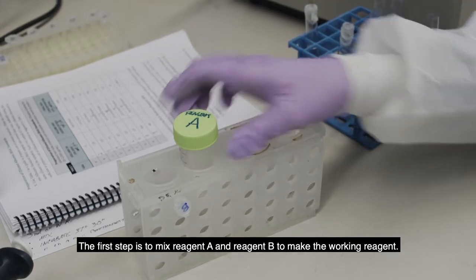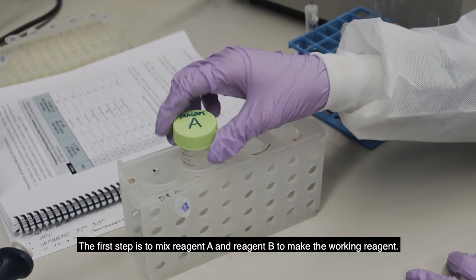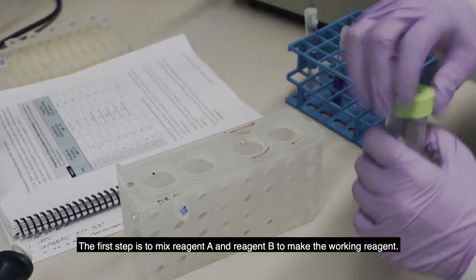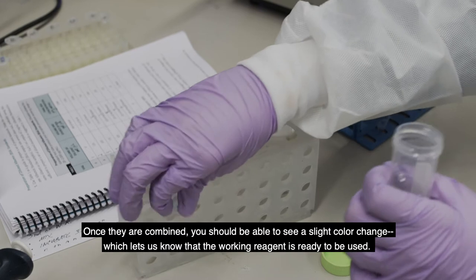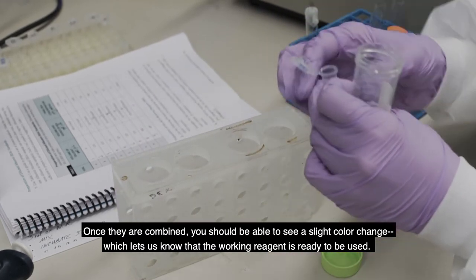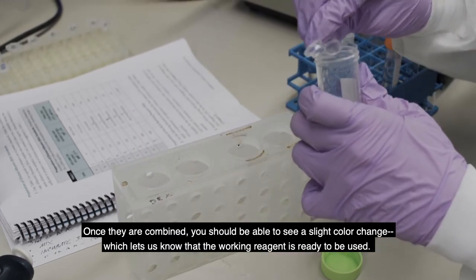The first step is going to be to mix reagent A and reagent B to make the working reagent. And once they're combined, you should be able to see a slight color change, which lets us know that the working reagent is ready to be used.